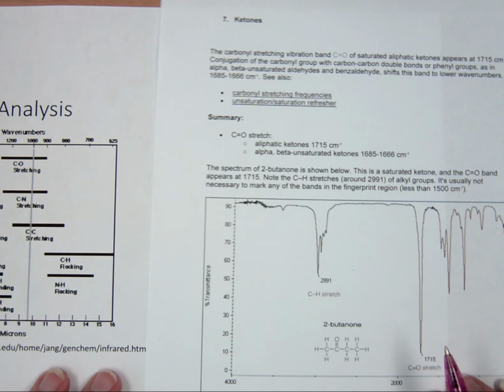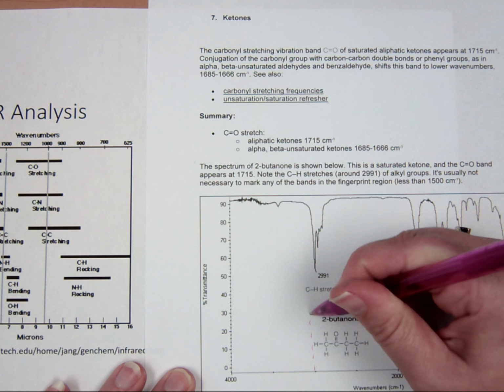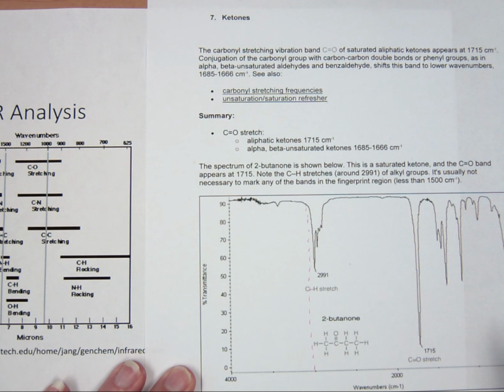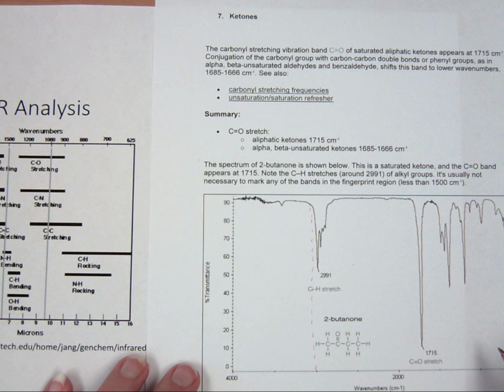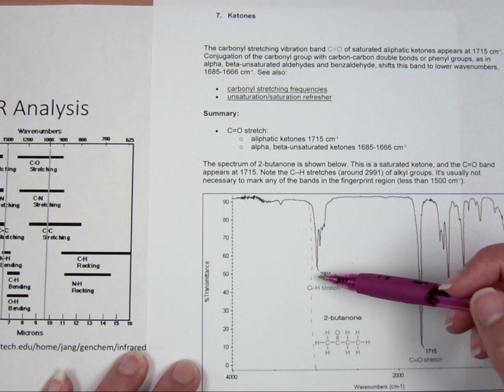All right, the last one we're going to look at. Again, we're going to take our 3000. And you can use a ruler for this. I'm not so great at drawing straight lines, but oftentimes I'll go back and check this with the ruler just to make sure my line didn't curve too much.